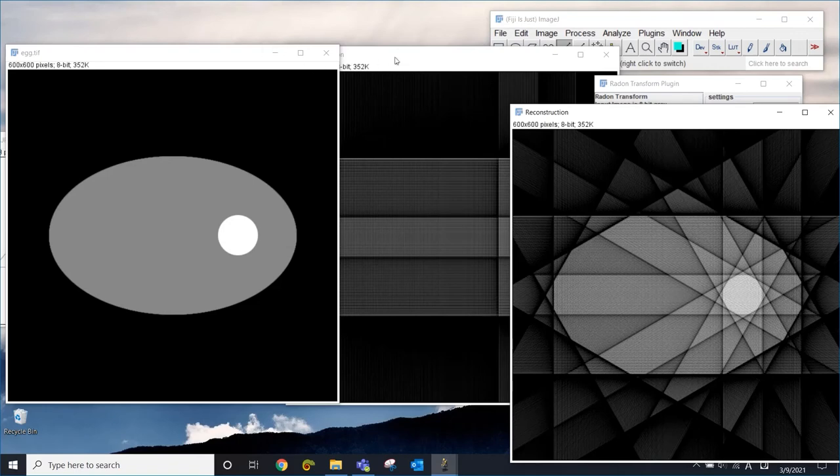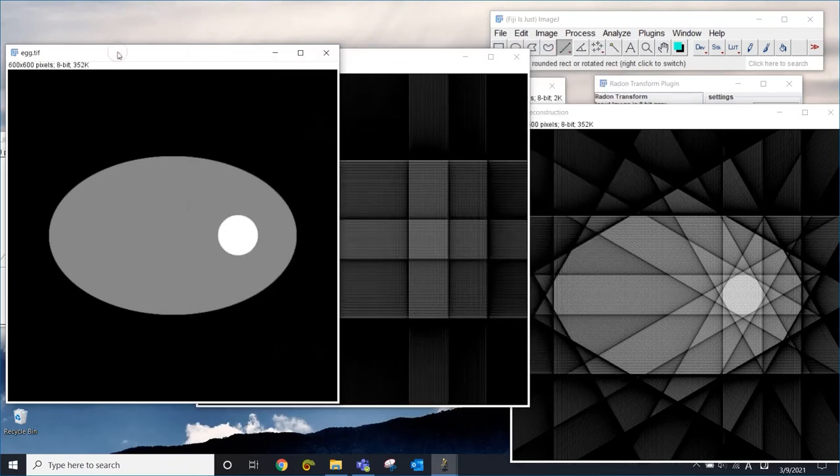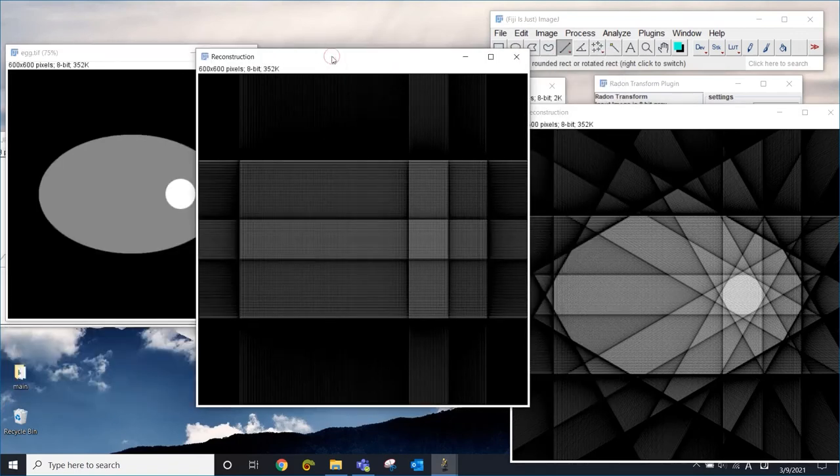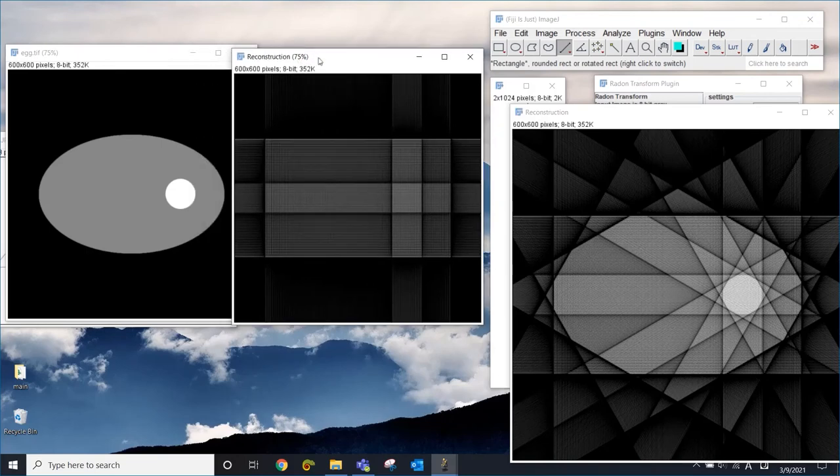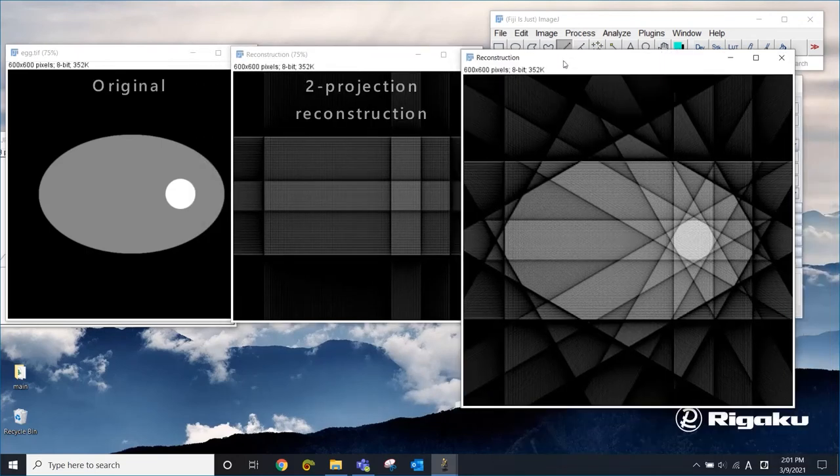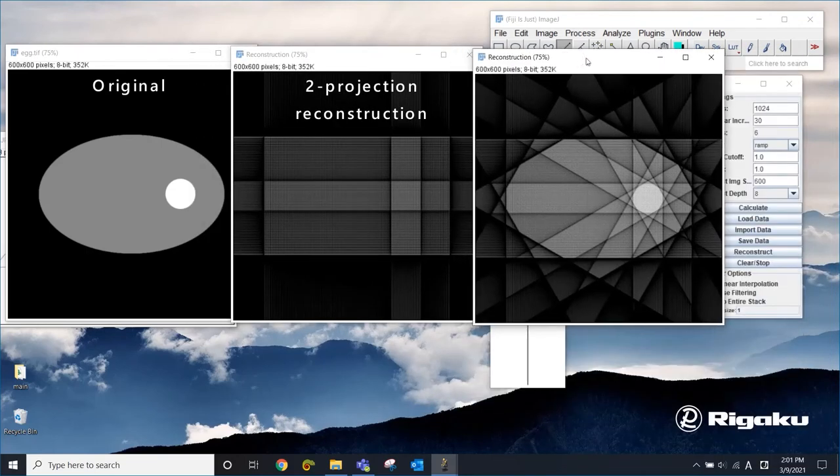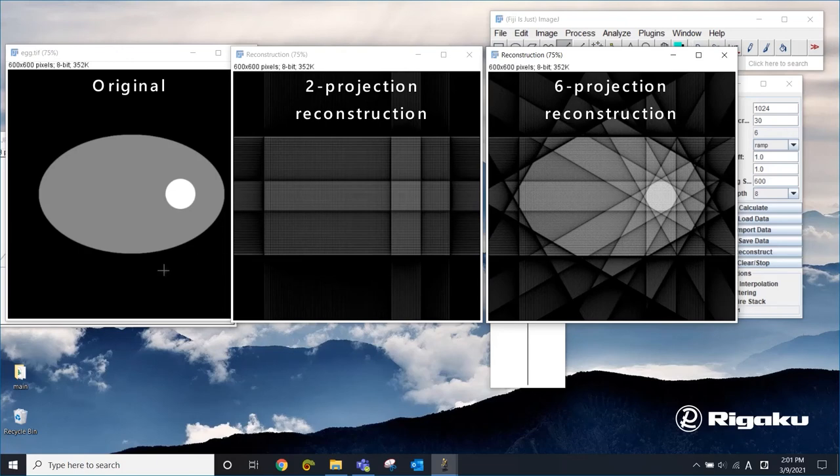Let me make this smaller so that we can do a better comparison. Those are two projections. And this one is six projections. You can see that when you have six projections, the reconstructed image is getting a lot closer to the original image.